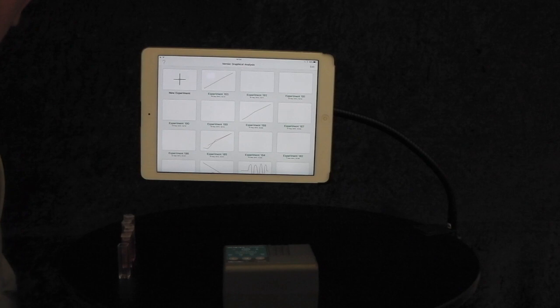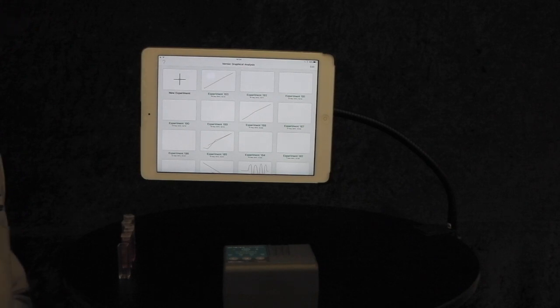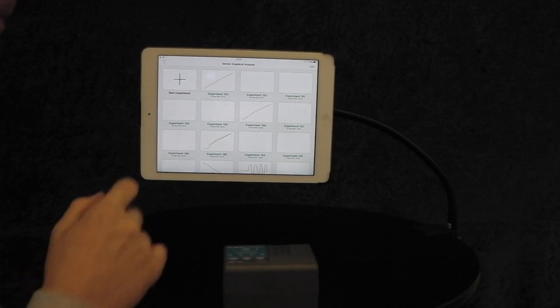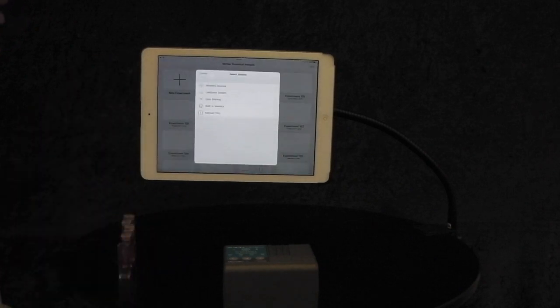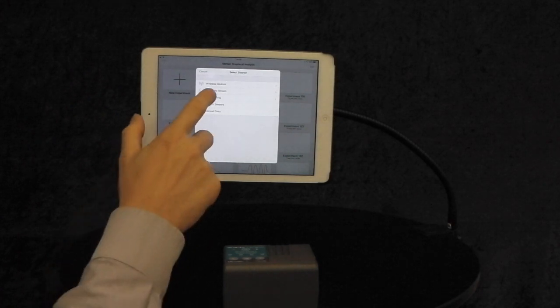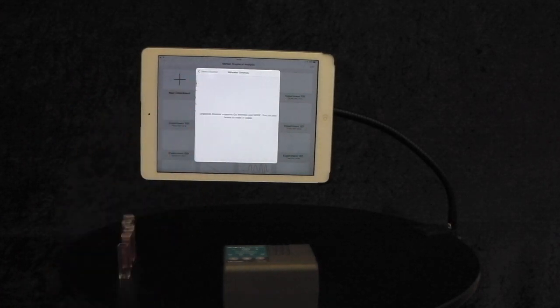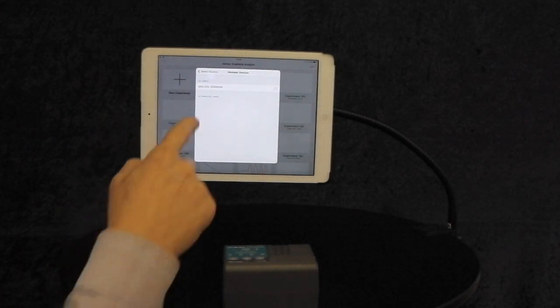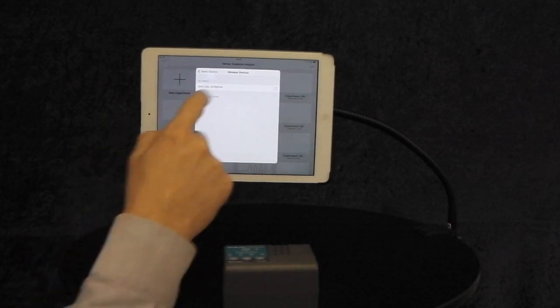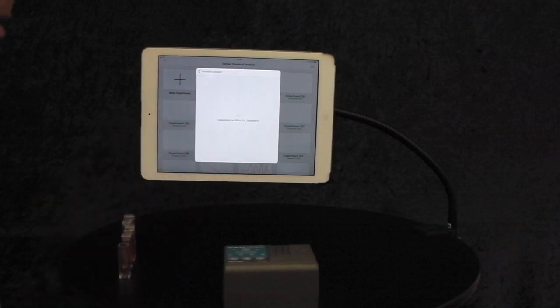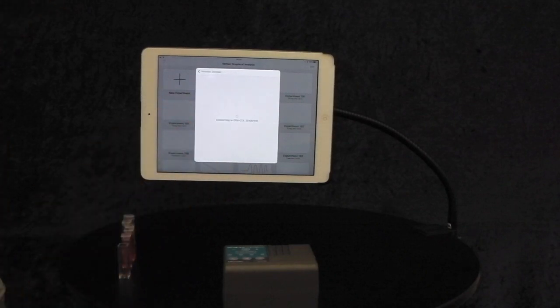Here's a quick experiment doing Beer's Law to determine the concentration of an unknown. We add a new experiment, click Wireless. Colorimeter comes up, tap it, you'll be connected to it.